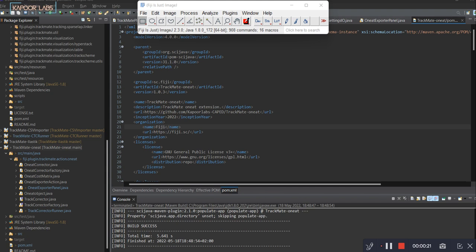Now, TrackMate is the most popular tracking solution which is available in Fiji/Java, and by default TrackMate gives you frame-to-frame linking and segment-to-segment linking, so you can actually get the dividing cells from TrackMate algorithms using default cost metrics of distances, and also customized cost metrics of using the size and intensity information of your cells in the process of tracking.